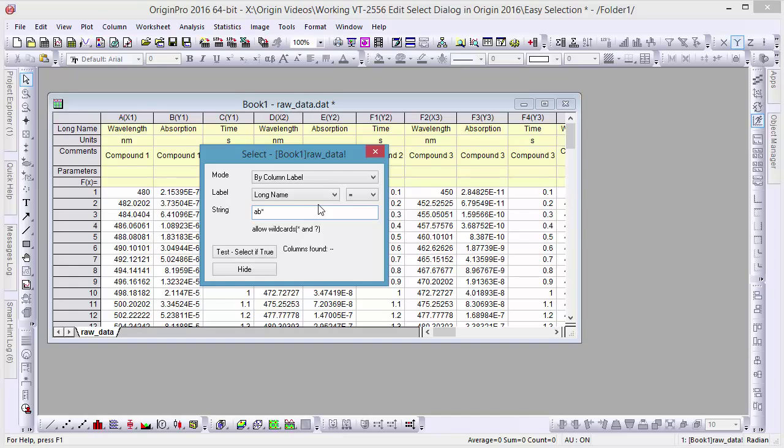This way, any absorption columns with typos, besides the first two letters, should automatically be included in our selection.